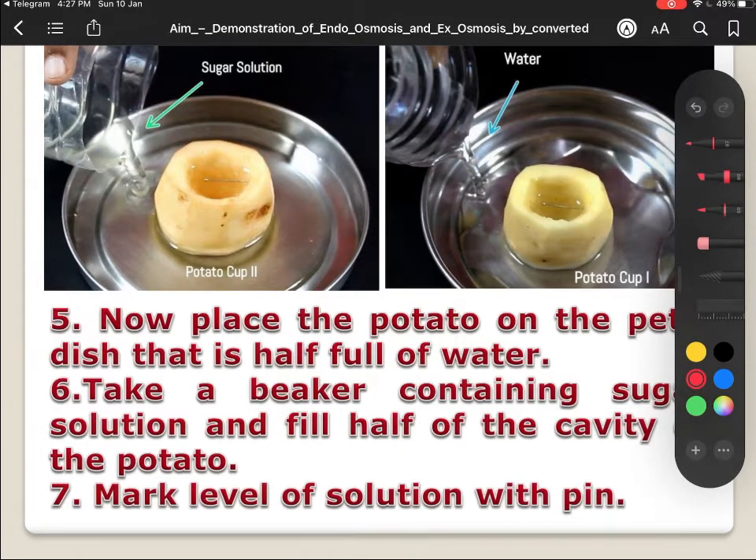We are going to name these potato osmoscopes: the first as A and the second one as B. In the first setup, you can see that outside in the petri dish a 20% sugar solution is poured, and inside this potato osmoscope, water is there. Water is diluted as compared to the sugar solution. This is the setup of the first experiment.